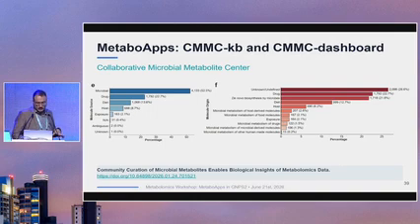And also you have drug information, de novo biosynthesis, diets, hosts, microbial metabolism of food, microbial metabolism related to the host, and also to drugs.